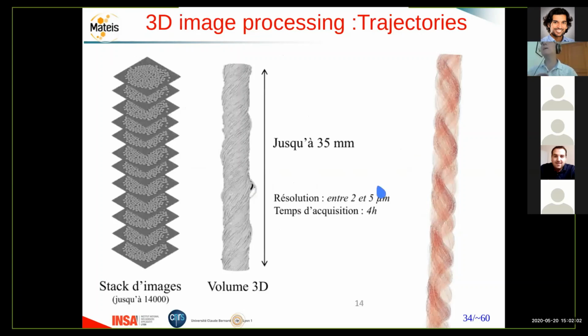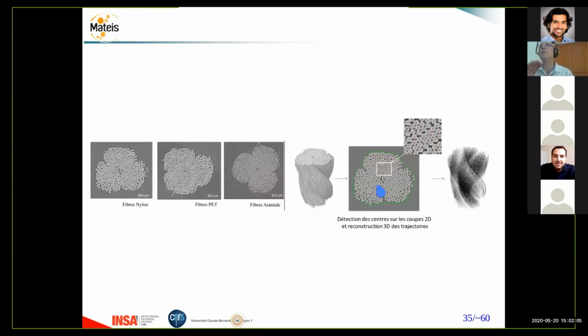And it's the only example in image processing where I work on slices. Normally, I work on volumes because it's better using volumes. But in this peculiar case of fibers which are cut by a plane, it's better to work in slices. And then there is a procedure: you try to track the slices, how they go up.